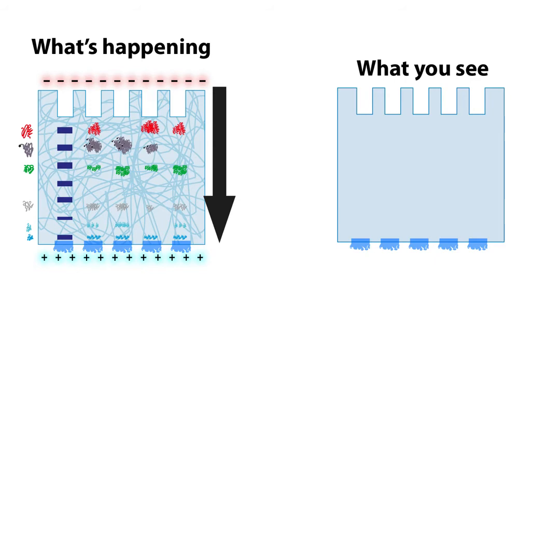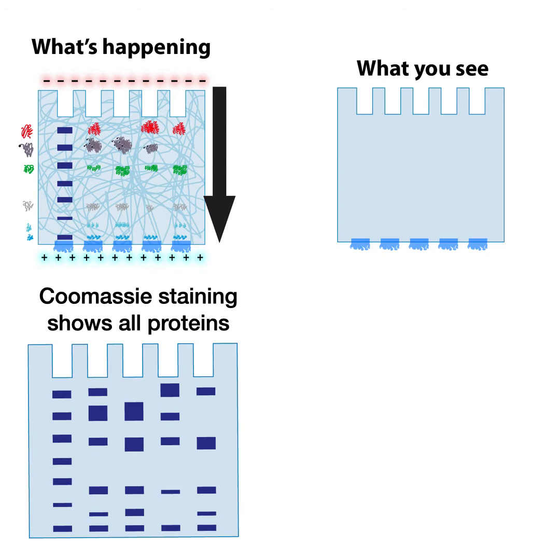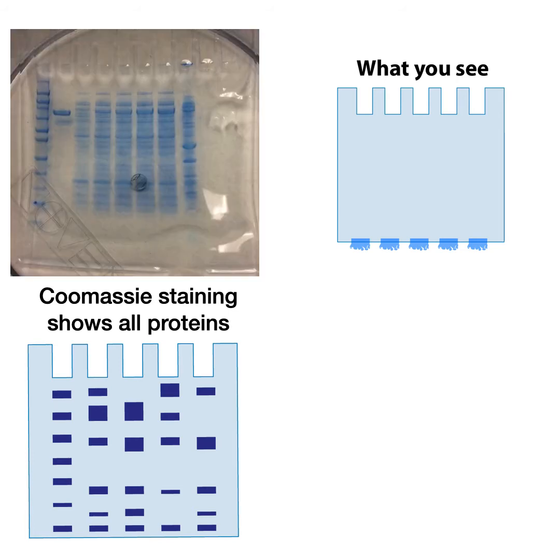So you start the same way, whether you're doing a normal SDS-PAGE or a Western blot. With a quote-unquote normal SDS-PAGE, what you might do is Coomassie staining, which is an all-protein stain, and so you're going to see bands for all the proteins that are present. But you don't know what those bands are.